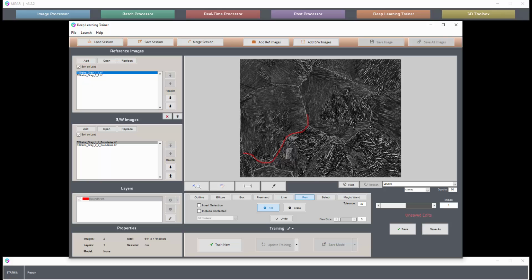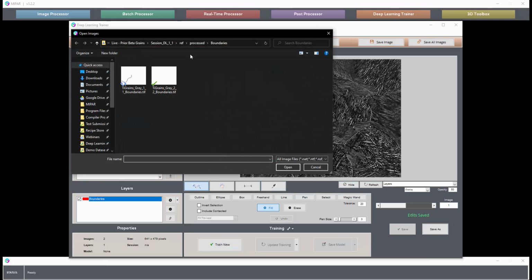But what we actually did in this case was drop these images over to an iPad, and use any of a number of tracing apps that are available. You can use the built-in markup application. We use an application called Procreate that we like. And it's a very natural, much more enjoyable experience with the Apple Pencil and the iPad tech these days to just do your annotations on something like that. And then you can import those right over into the training environment. So what I'll actually do is just go grab those tracings that we've made.